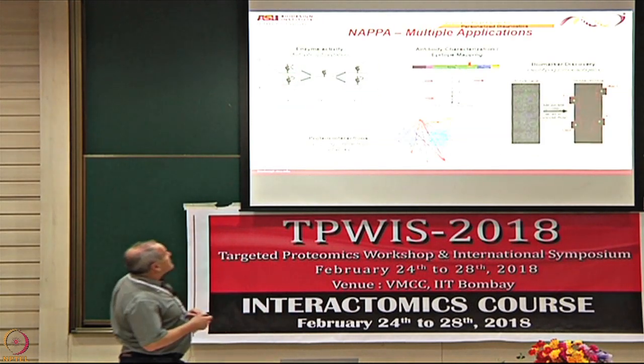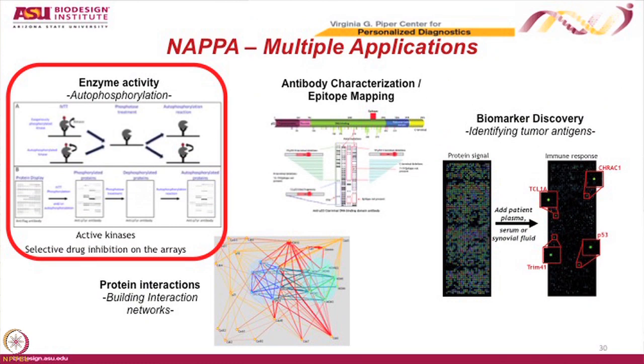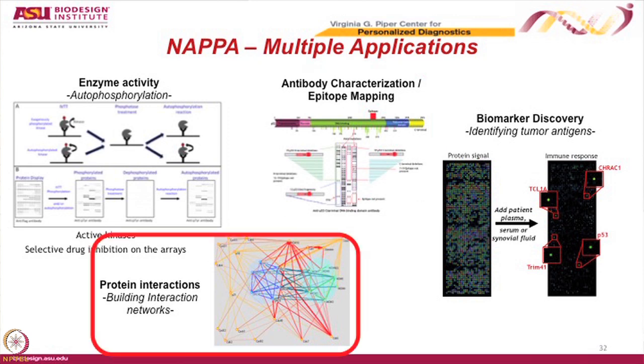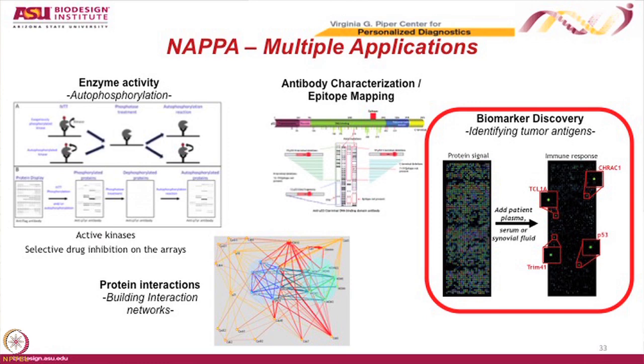So these are some of the things that we've done with it about the protein phosphorylation, and I'll probably do that in my last talk. I talked a little bit before about mapping protein domains. We talked about the protein interaction studies. And now I'm going to focus a little bit more on biomarker discovery.